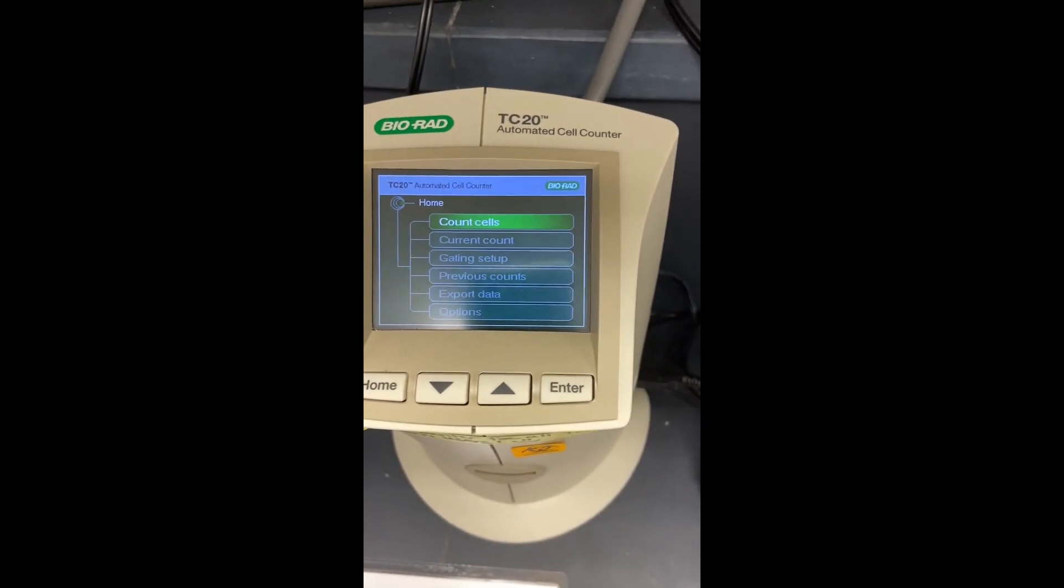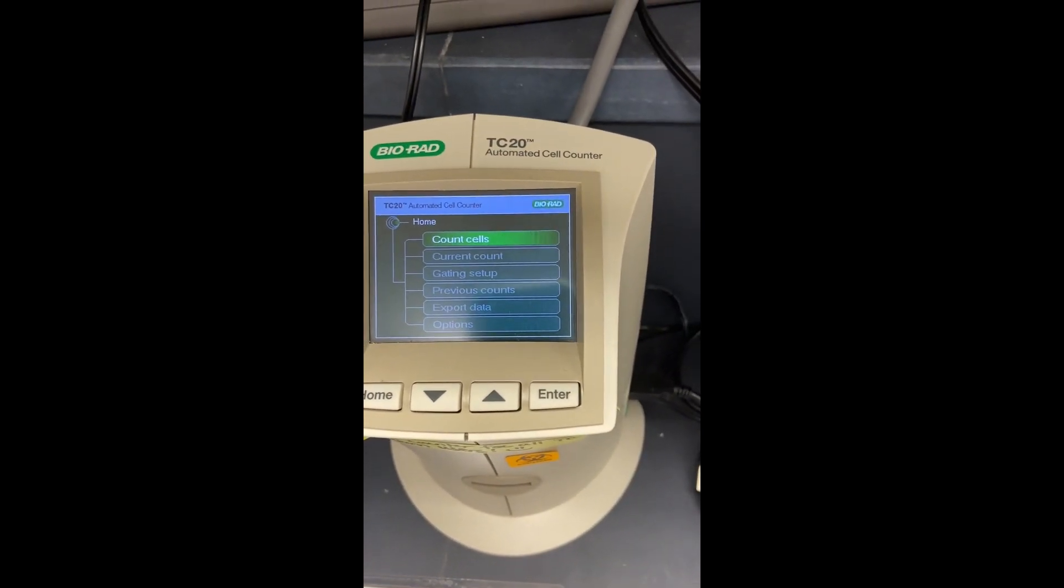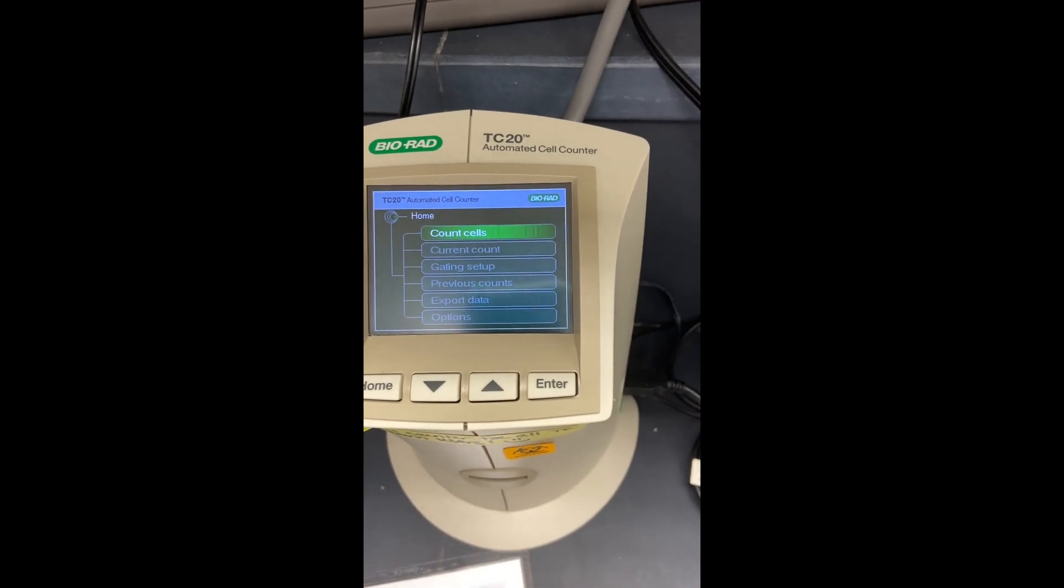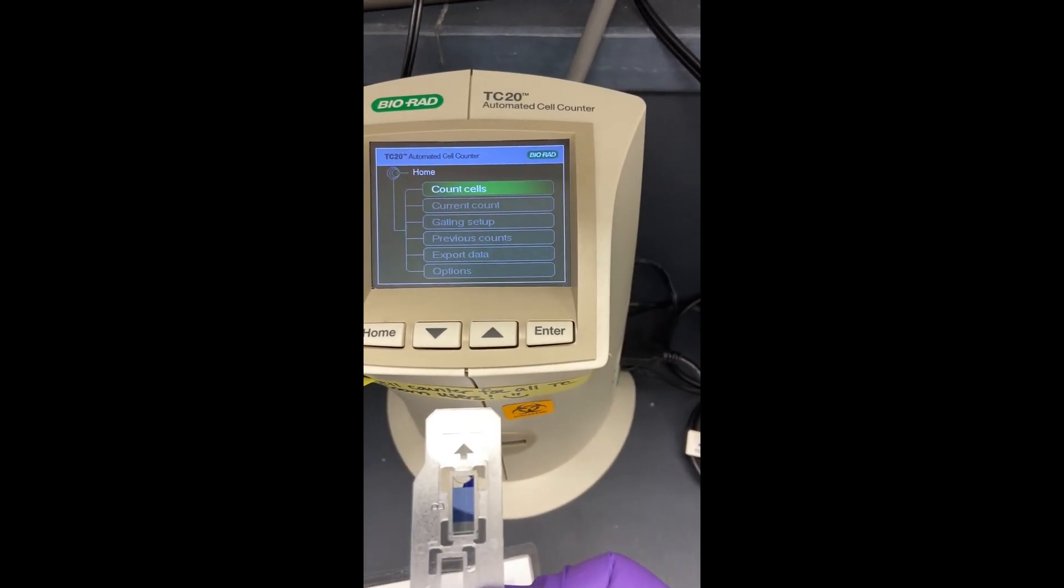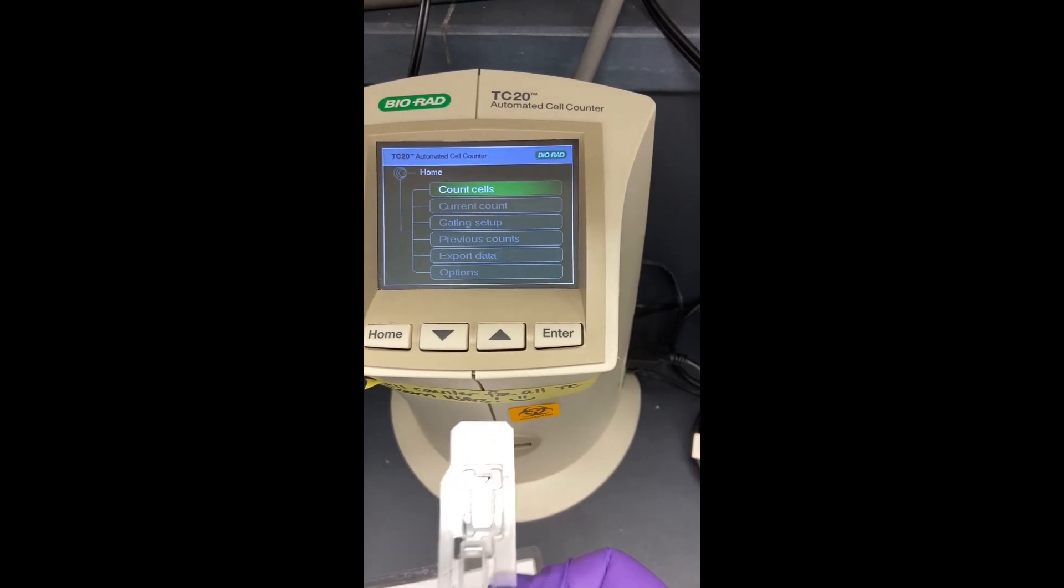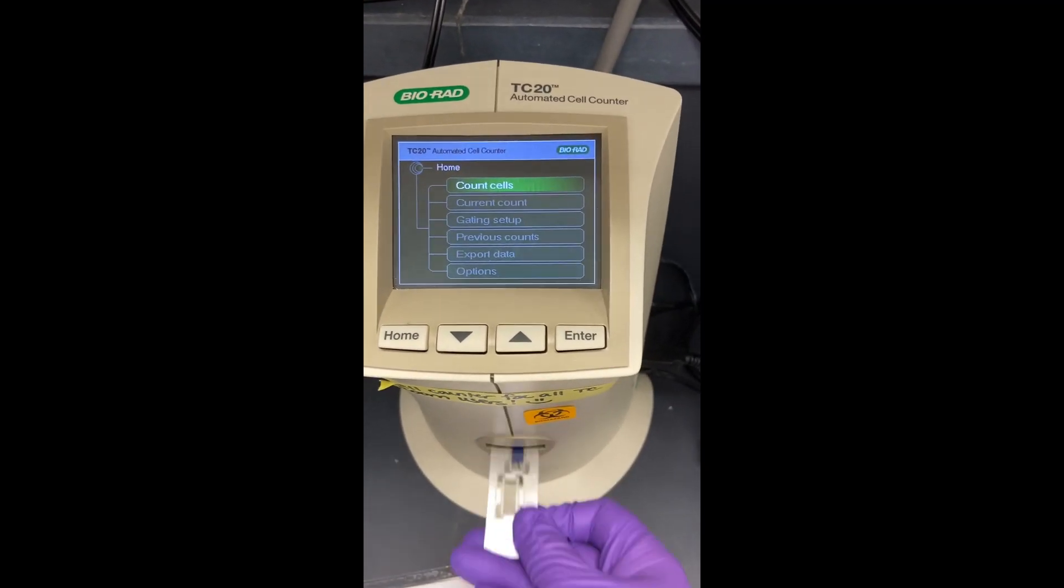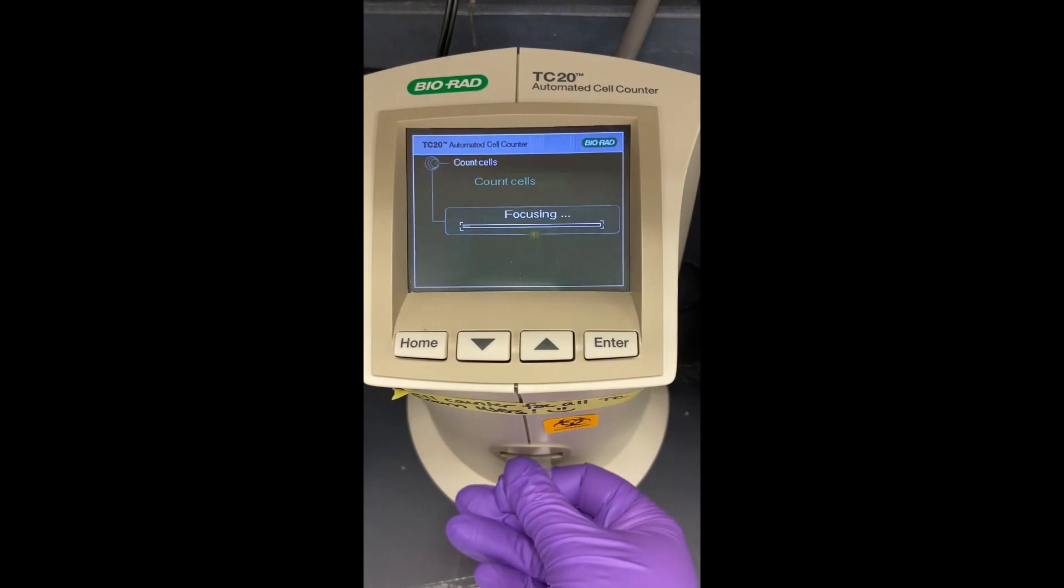And so when it comes up, it comes up with this menu where you can count cells and do all these different things. But honestly, all you really do is take the slide. So again, this is side B with the trypan blue and put it in there.